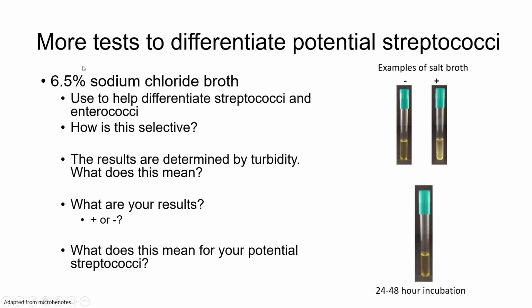And then we have just some salt broth. And if you inoculate some salt broth, sodium chloride, if it can grow, it'll get cloudy after incubation. If it doesn't grow, it stays clear. In this example, she's saying no growth in the salt.